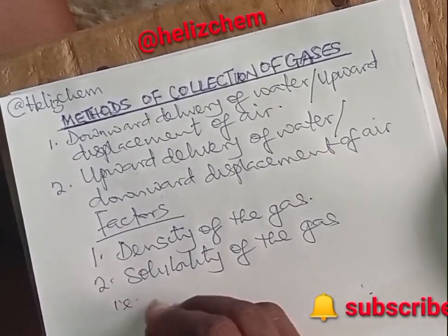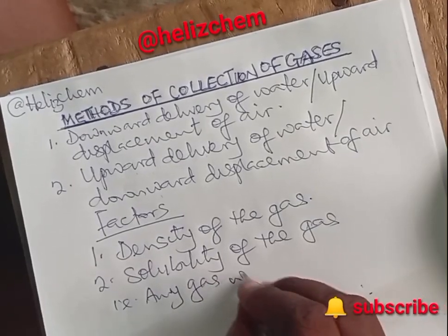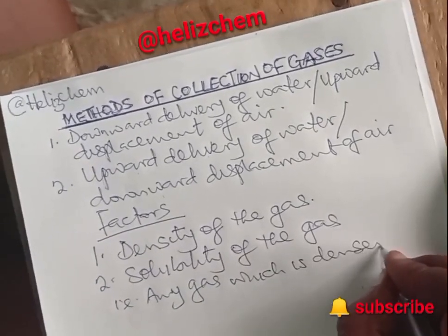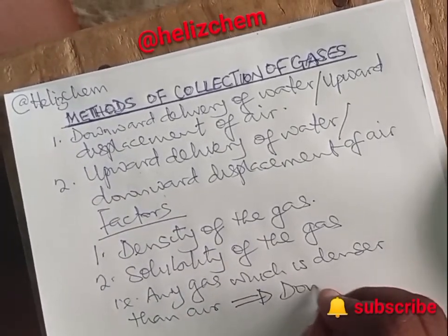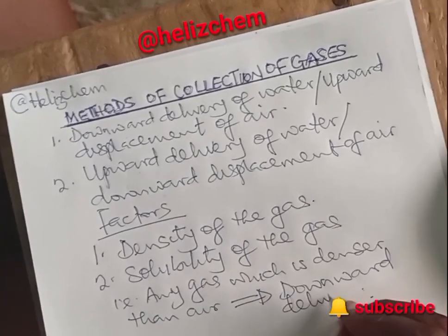That is, any gas which is denser than air will be collected by what? Downward delivery of water.